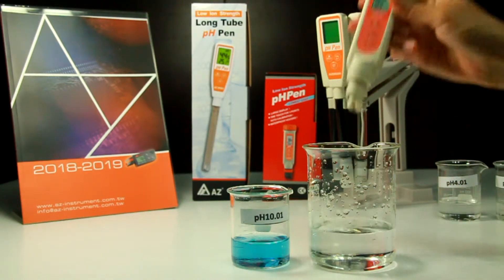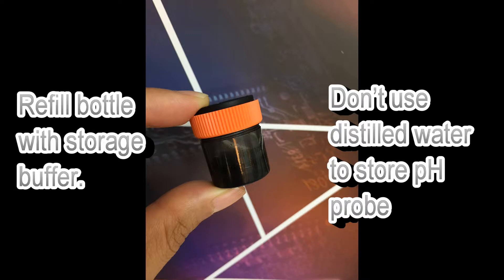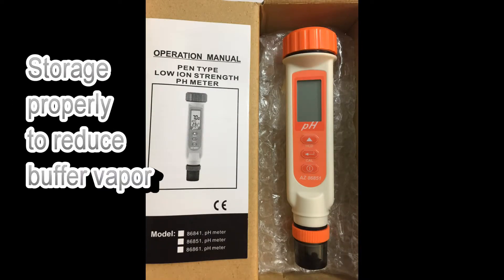Clean the electrode with water before immersing it into storage buffer. If the storage buffer is dried, please buy storage buffer locally to refill the bottle. For emergency cases where storage buffer cannot be acquired immediately, use PH4 buffer or tap water for temporary storage. Do not use distilled water to store the probe. Keep the PH pen in a cool place, away from sun exposure, to reduce storage buffer vapor.